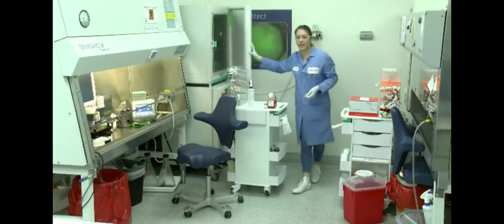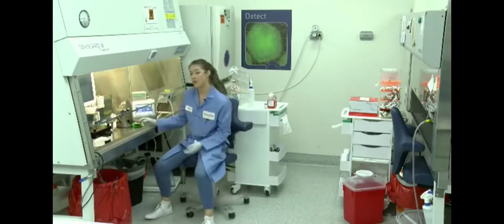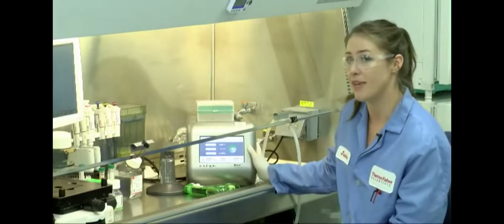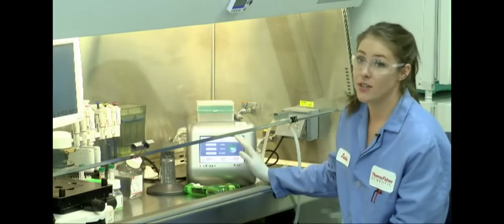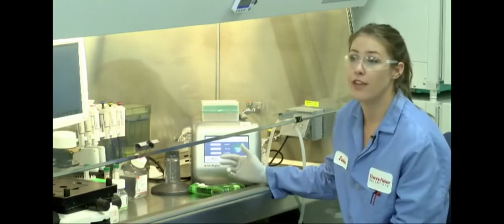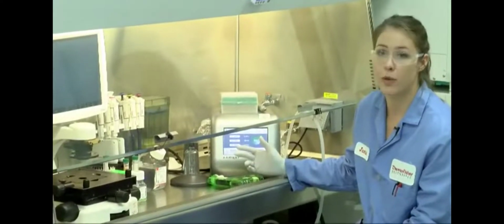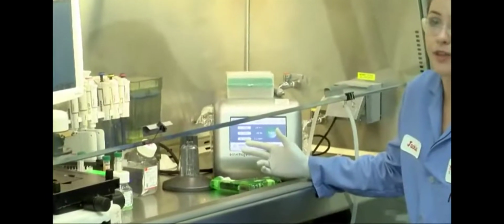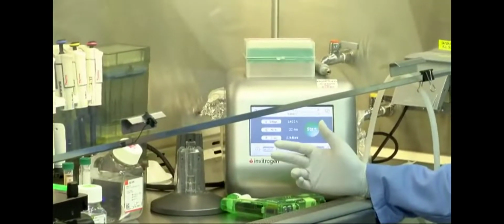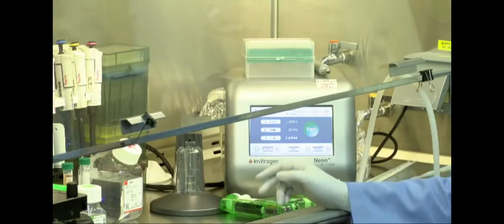While the cells are dissociating, I'll tell you a little bit about the Neon transfection system itself. There are 3 main pieces to the device. One is the Neon device, which is this silver benchtop piece right here. It has a really easy to use interface with a touch screen. It also comes pre-programmed with a 24-well optimization protocol. If you're looking to determine which protocol is best for your cell type, there is an online Neon cell database, and it has recommendations for the protocols for most common cell types. I would check that out if you don't know which one to use.